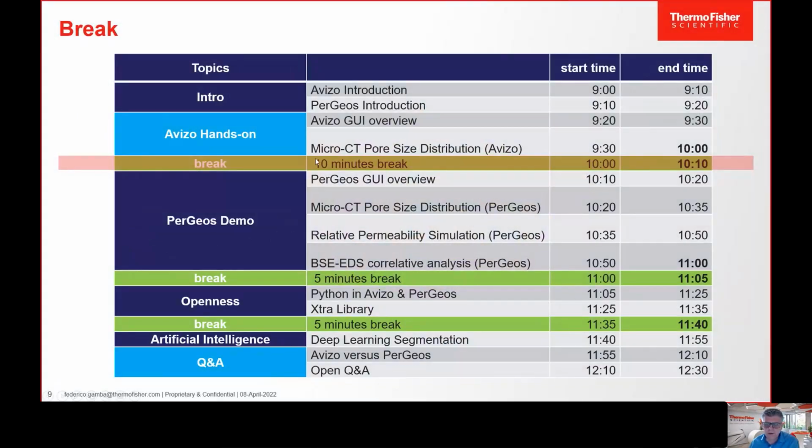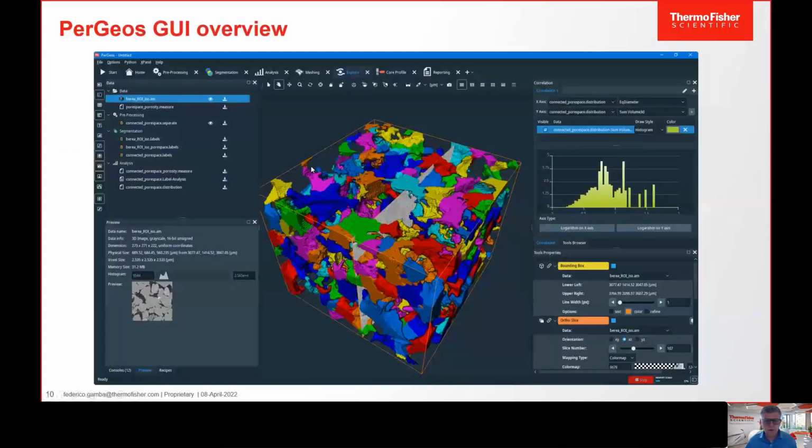So here we are where we are. I think we could have a break for 10 minutes. The next step is to give you an overview, first of all, of the user interface, and then I will play a similar video a little bit faster with a similar workflow in PerGeos. So let me show you PerGeos.